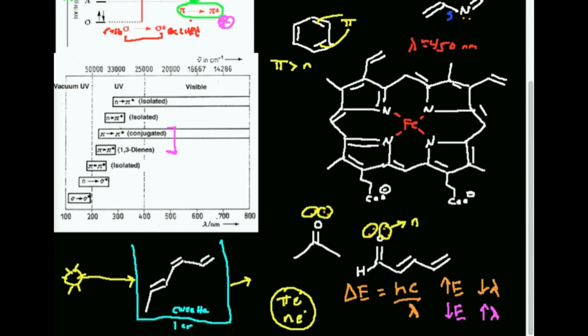If you have a protein that has a specific coenzyme in it, like this heme B, and that coenzyme absorbs, then you can use that. If your protein doesn't have a coenzyme, sometimes there are amino acid residues in the protein, like tyrosine, tryptophan, and phenylalanine, that absorb at wavelengths in the UV-Vis region, and you can detect the proteins that way. So it's very useful. Also, if you're measuring DNA or RNA, DNA has a specific wavelength of absorption in this range. RNA has a different wavelength of absorption that's also in this range. And so you can identify DNA and RNA in a sample and see how much you have.